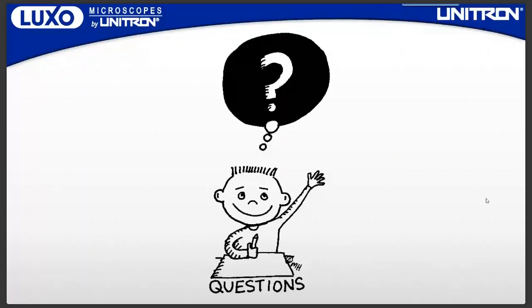So a question about edge detection. Does that need to be set every time you use the Omni, or is that something that's stored within it? Depending on what you're looking at, if the part is different colors, different lighting, whatever. But when I save those measurement files, it saves the edge detection parameters as well. So in that sense, it's reproducible when you open the file. You might need to set it up initially, but once you've saved it into the file, then it's okay.